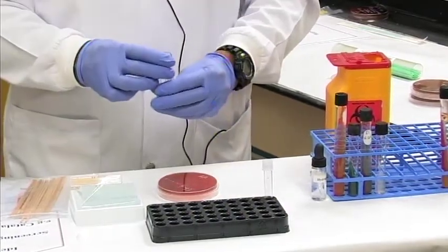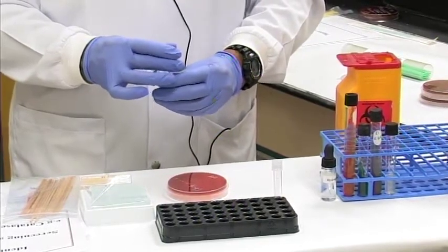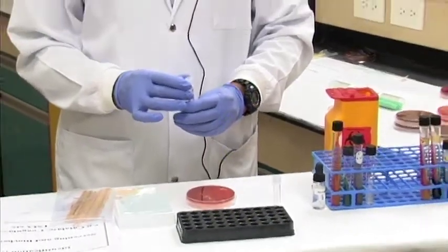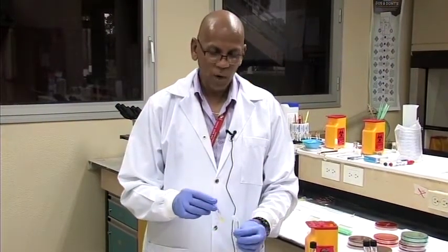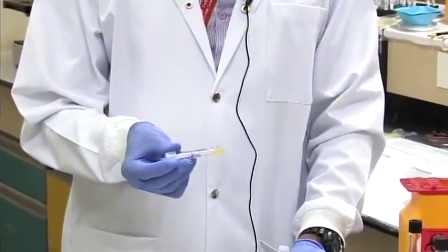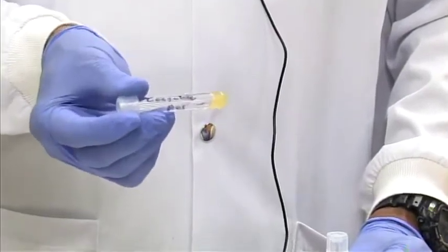The enzyme coagulase converts fibrinogen to fibrin, and the species Staphylococcus aureus possess that enzyme, and thus we expect to see a clot, because fibrin will reveal a clot. So here we have 2 tubes that have been incubated, one positive and one negative. The positive one, Staphylococcus aureus, we tilt the tube and we see a clot has been formed. Notice if I tilt the tube, there's no liquid here, it has formed a solid clot.